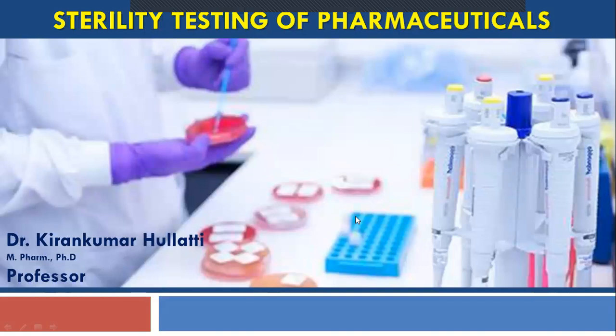We apply a number of different sterilization processes based on the ability of the product to withstand temperature or not, or some chemicals or not. They are based on that, so they will be subjected to the sterilization process. And this sterilization process is meant for these products so that there should not be any contaminating organisms. And once the sterilization is completed, the next and a very important step is the testing. Test for sterility. We call it the test for sterility.